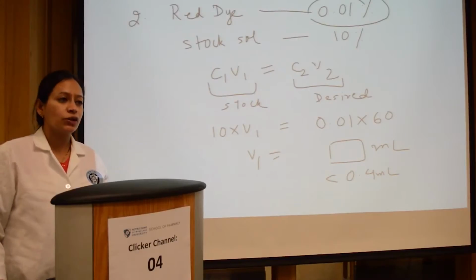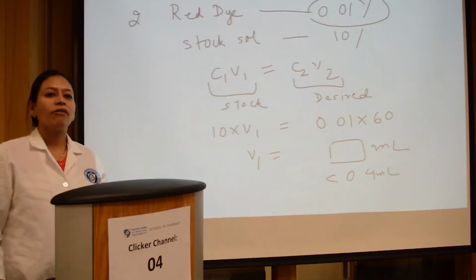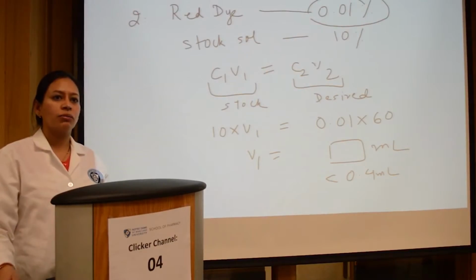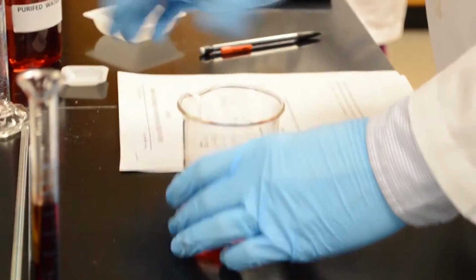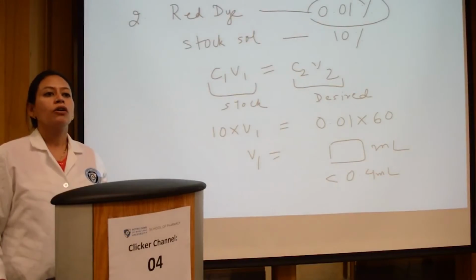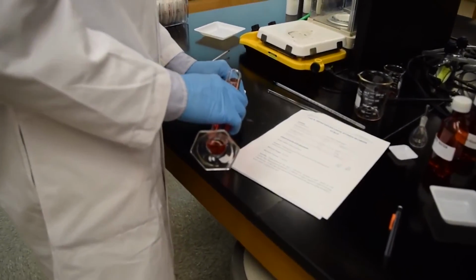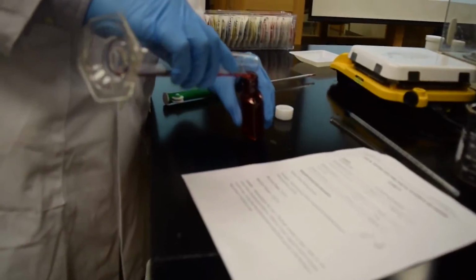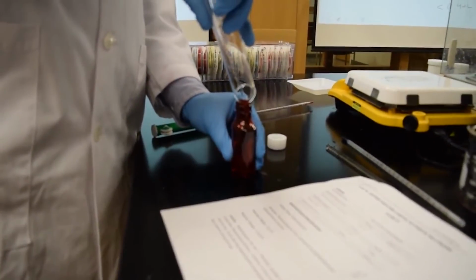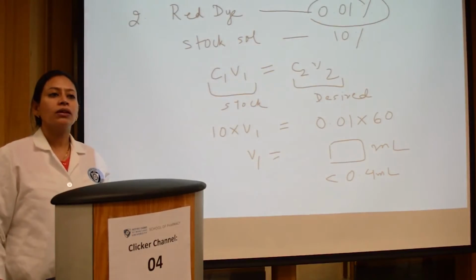However, because it's a medicated syrup, it's not just a plain sugar syrup. You have to have your drug, which is your diphenhydramine hydrochloride, add the flavor and the colorant in a separate beaker, and then mix the two things together. Okay, so that will give you the final diphenhydramine hydrochloride syrup. Alright, so once you formulate your syrup, let it cool down and then label the preparation appropriately and dispense. Any questions?